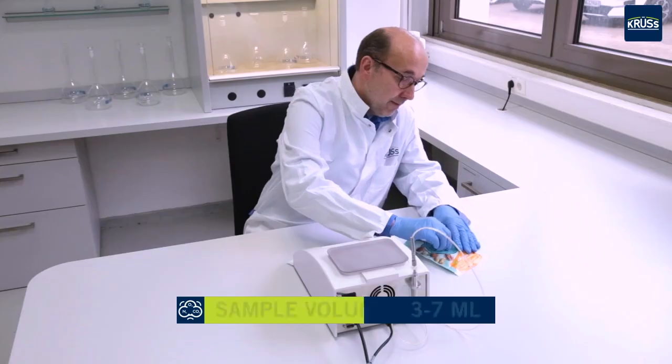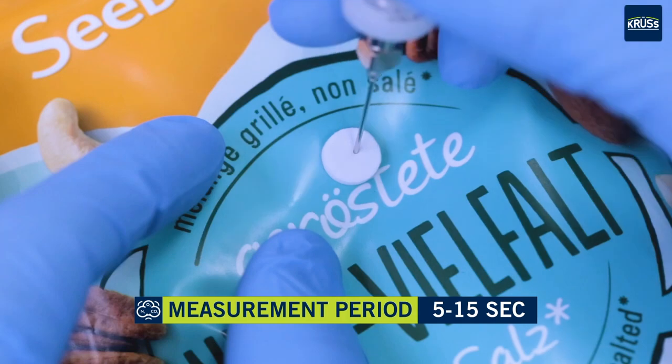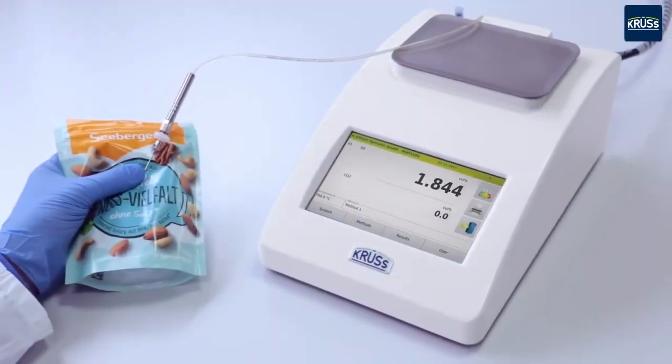The puncture site of the package is sealed with a septum. The needle is used to puncture the package. Pressing the button starts the measurement process and the gas mixture is aspirated from the package into the measuring device.